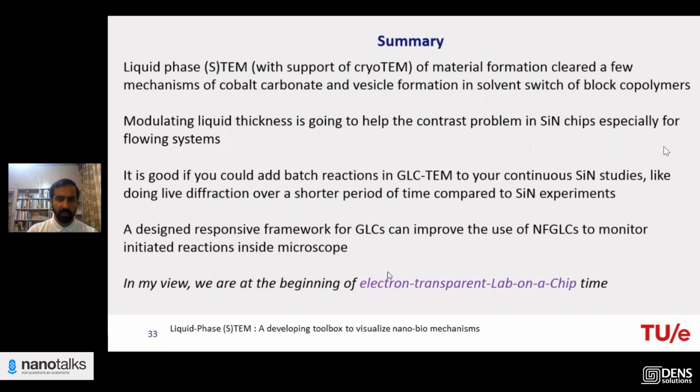With this, I just want to summarize what I have spoken about. I have spoken about liquid phase TEM with support of cryo-TEM. This is very important, so to use correlative techniques with liquid phase, and using liquid phase also as a correlative technique to other studies. I have shown that for cobalt carbonate, I have shown that for the block copolymers, and I have shown how you can use a pump to control the thickness of the liquid inside the silicon nitride.